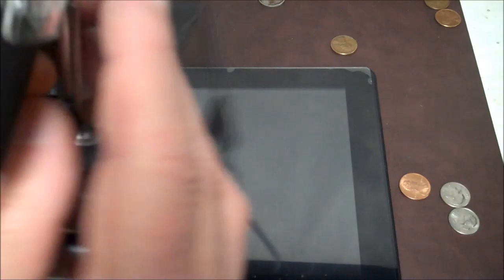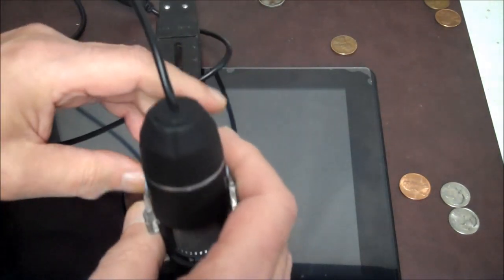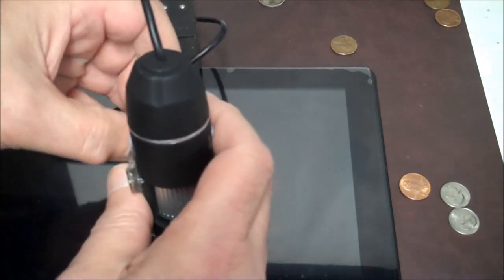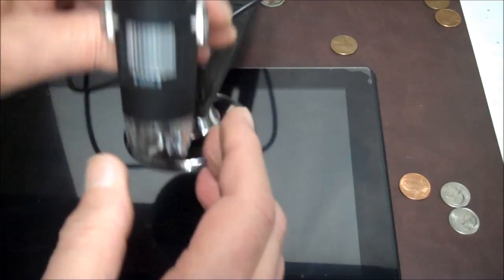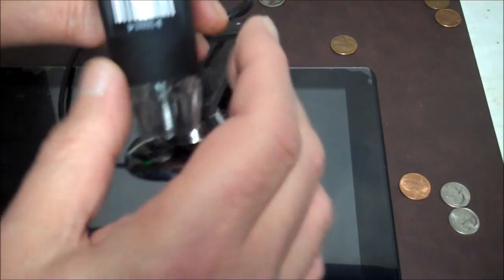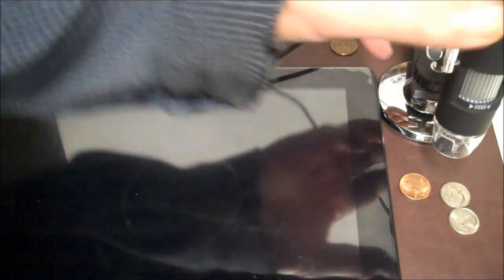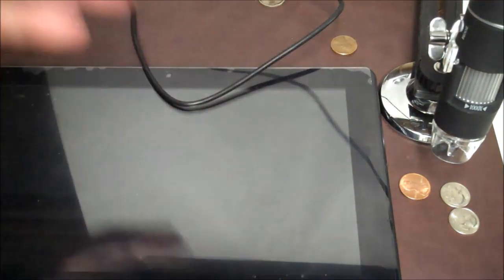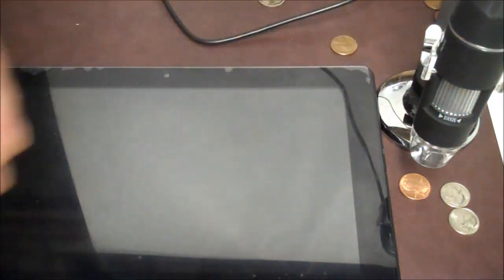Okay, so another thing is, let me straighten this out. Now when you're looking at it, if your thing here is in the front, then your picture will be oriented the right way. If it's any other way, it's going to be like backwards or sideways and you're going to be disoriented trying to look at the picture or trying to move on your object that you're trying to focus on.